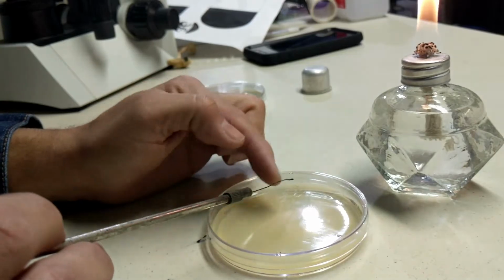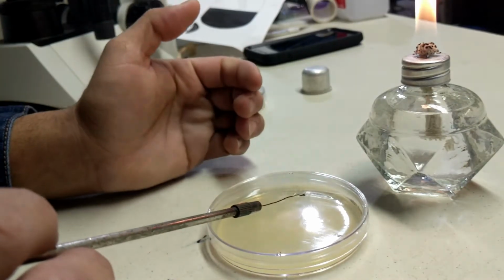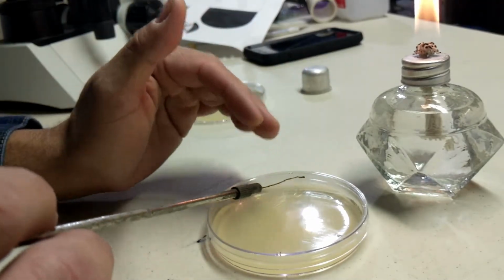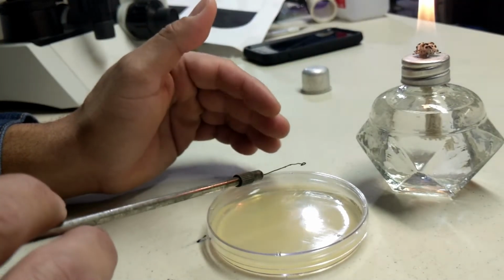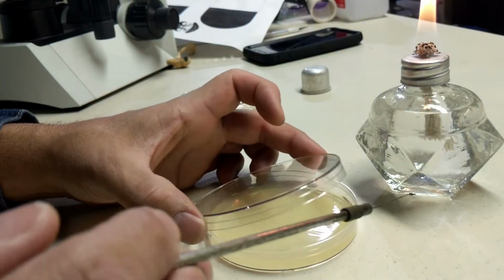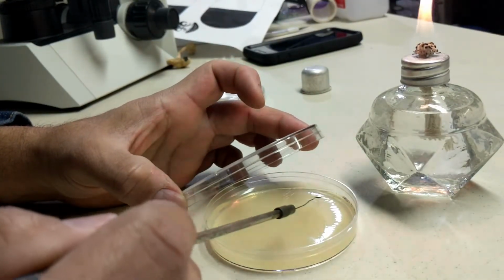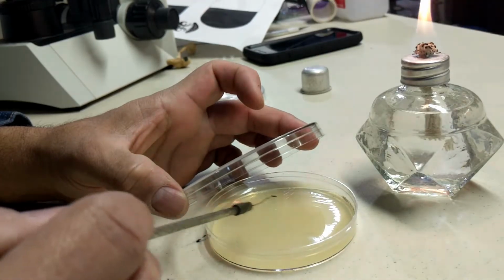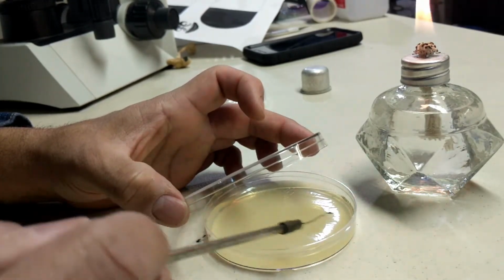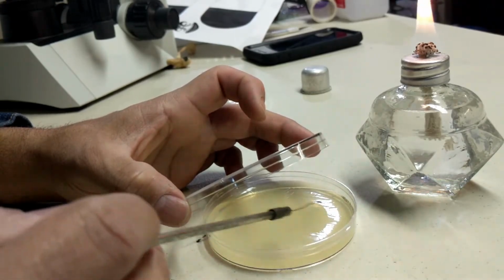And then you want to touch this specific area, which has bacteria already in there, although you don't see it because we haven't incubated yet. So you come here, right? And you come 1, 2, 3, 4, 5, and then you spread that bacteria in here.